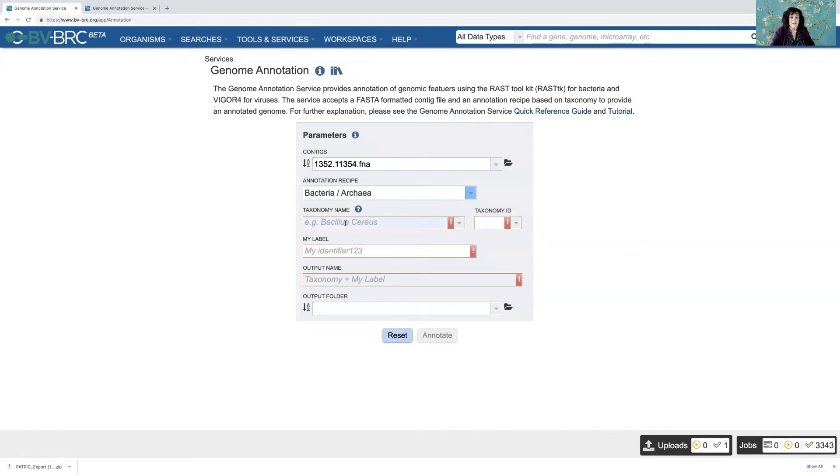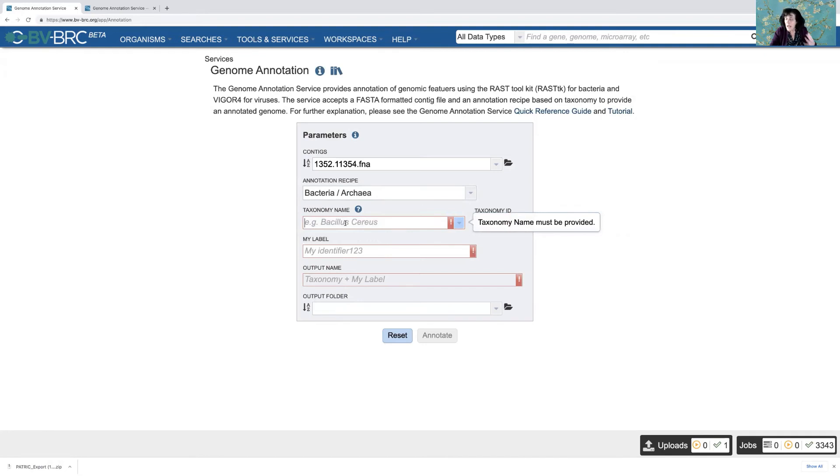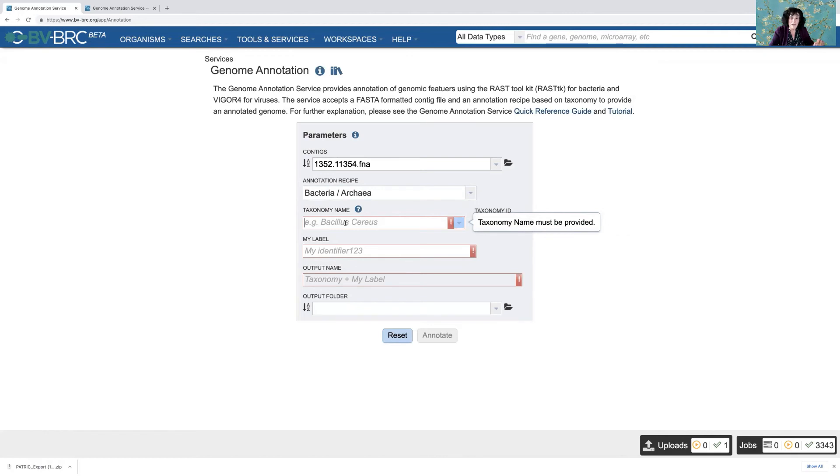So that's part of the second parameter done. Then I have to give it a name. For people who have used PATRIC in the past, you've heard me talk about how important it is if you can to get to genus for these things to get specific protein families. That's not the case with the viruses or the bacteriophages.